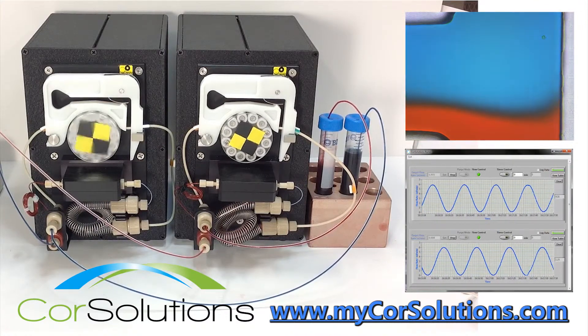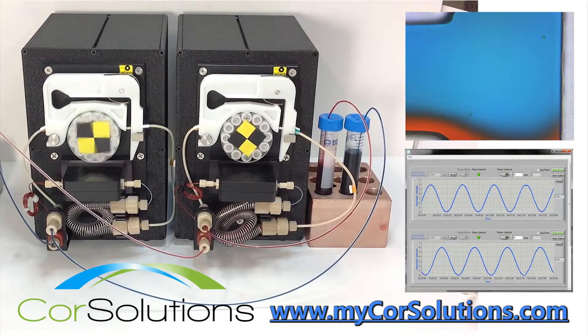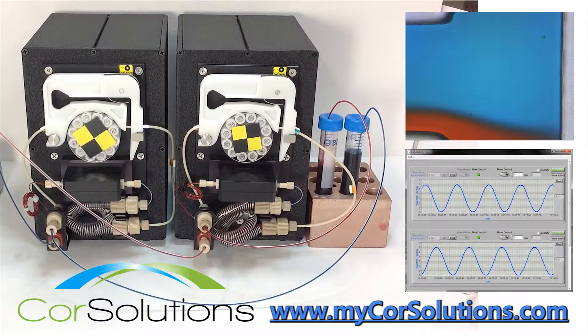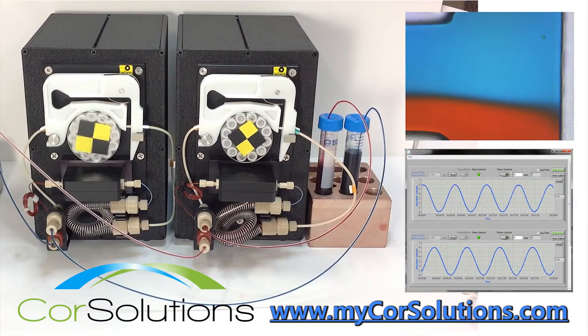The flow sensor-based dynamic feedback of the Core Solutions PeriWave pumps allows for pulseless flow and valveless switching, because each pump actively senses and adjusts to changes in the system in real time.